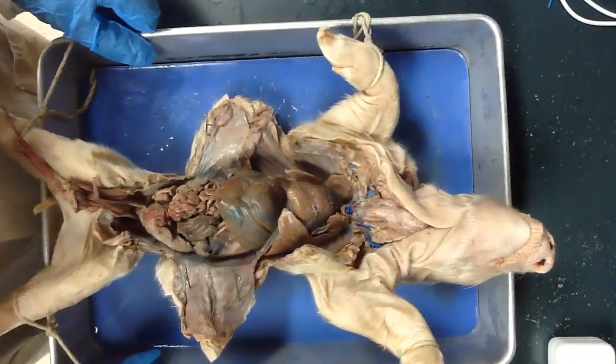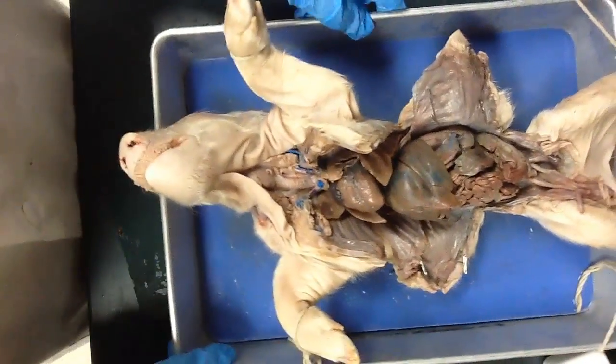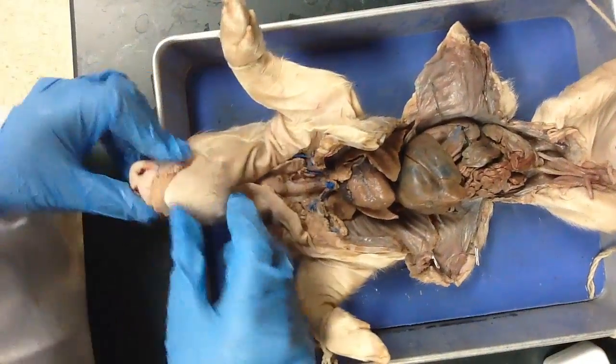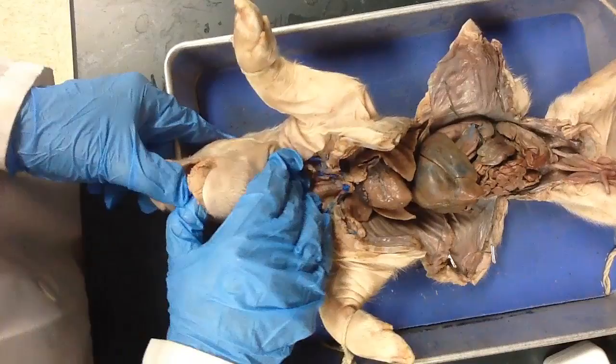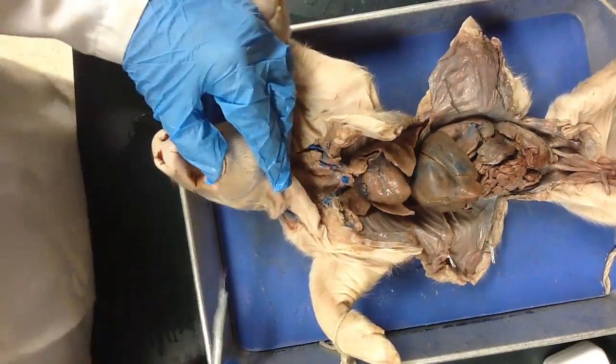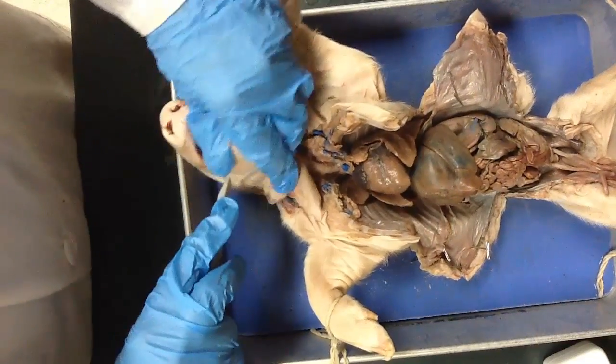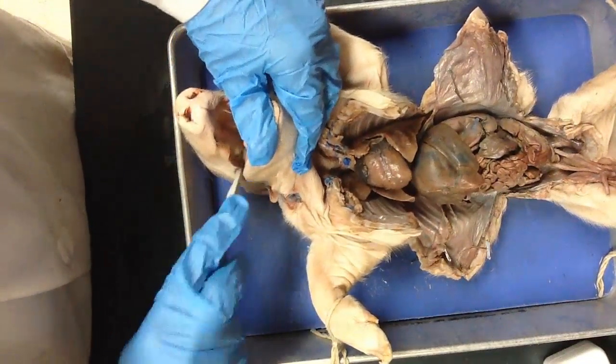For the digestive system, we have to go into the pig's mouth cavity. I'm going to turn my pig around and open up the pig's mouth very carefully, because there are teeth in there. I need to use my scalpel — and this is going to be kind of rough for some of you who are more squeamish — to cut right down the side of the pig's jaw.